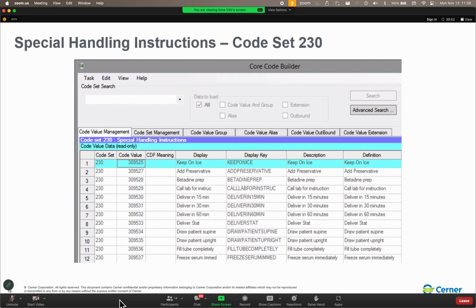All of these orderables currently work. All of these orderables currently have fully built out collection requirements. What we're going to do for the in-class activities, we're going to change various parts of the collection requirements, and then we're going to make sure that they still work. So make sure you write down your assigned order. And then we're going to go out to the domain. We're going to start making some changes.